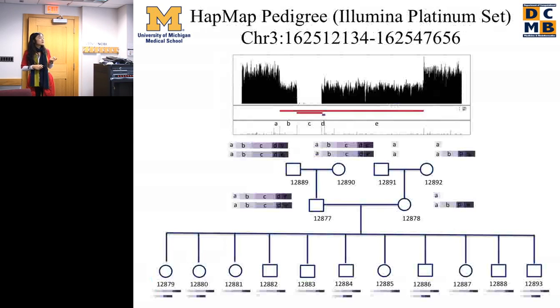This is the overlap of a long deletion with a smaller deletion inversion on the other chromosome. And here's the result we have. For this sample, the long deletion happened on both alleles, while for this sample, the overlapping events happened together with this. And in this family, they're all normal. Their structures are like what's in the reference genome.